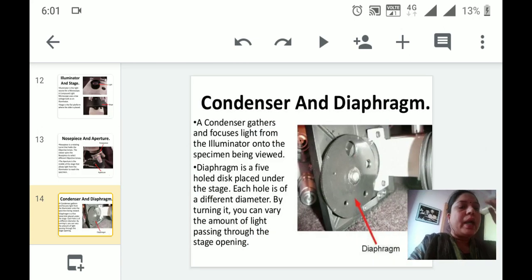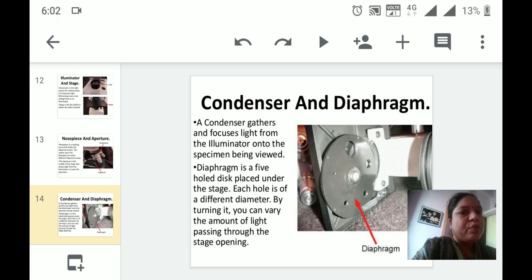Condenser and diaphragm: Both are present at the base of the microscope. The condenser is used to collect and focus the light from the mirror or illuminator on the specimen, whereas the diaphragm is a five-hole disc placed under the stage, and each hole is of different diameter. By turning it, we can vary the amount of light which is passing through the stage opening. Everything—the condenser, diaphragm, objective lenses, eyepiece—is used to focus and capture the image of that particular specimen very keenly.